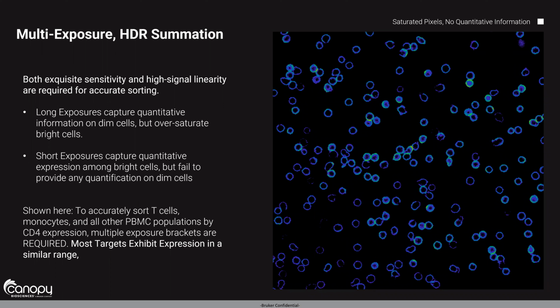And then you have other cells that are blazing bright, and those are actually your T cells. In order to identify these individual cell types, you actually have to do some extra hardware, fancy technology, not tricks. But we've employed a mechanism of doing this to actually collect that data again in a meaningful way.